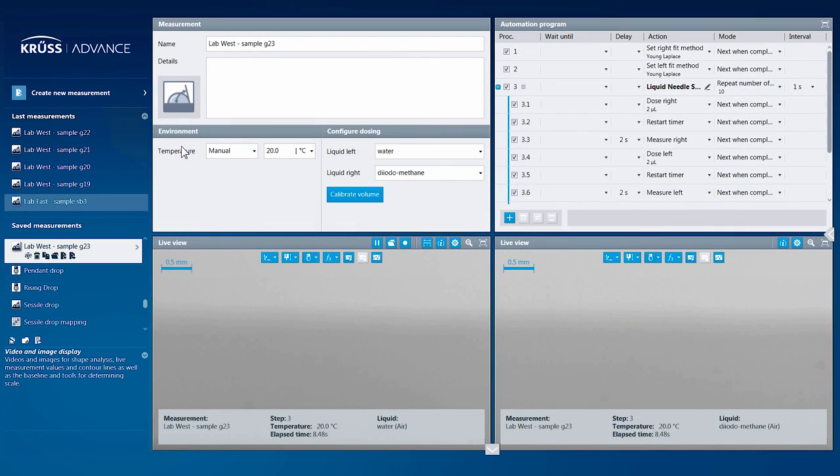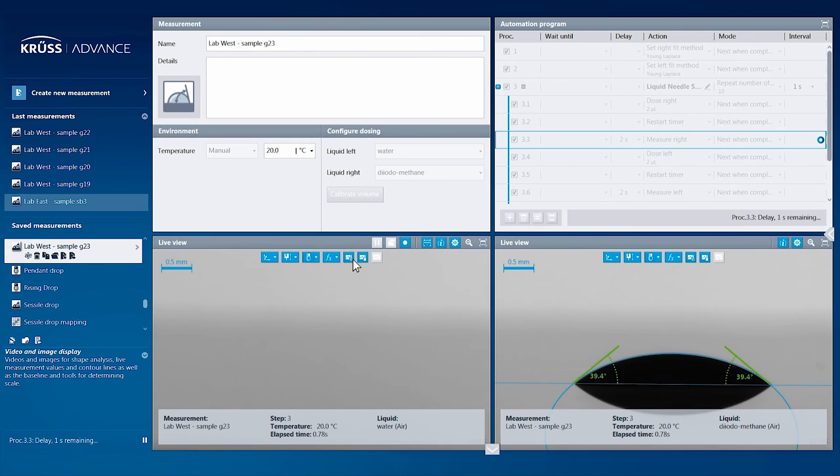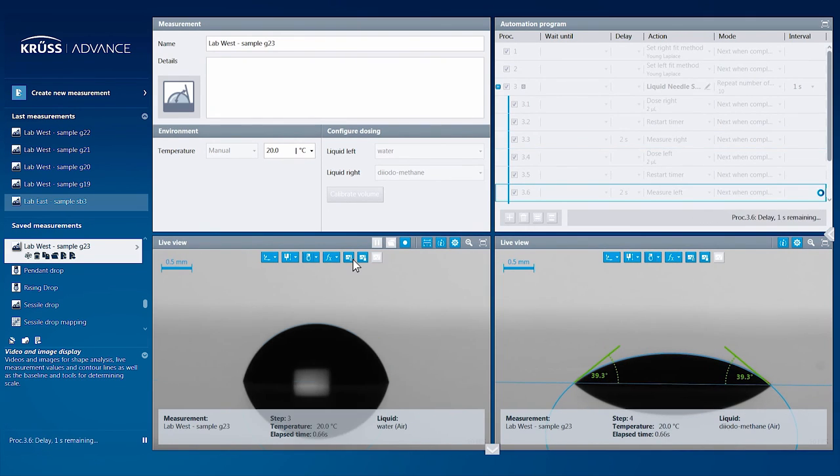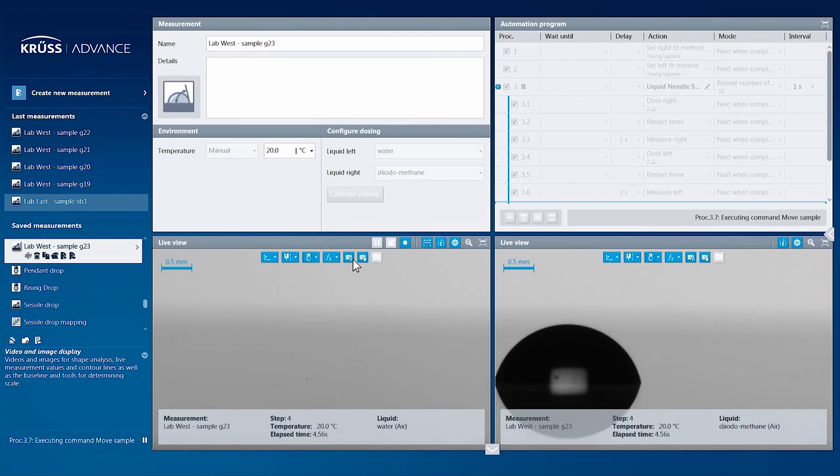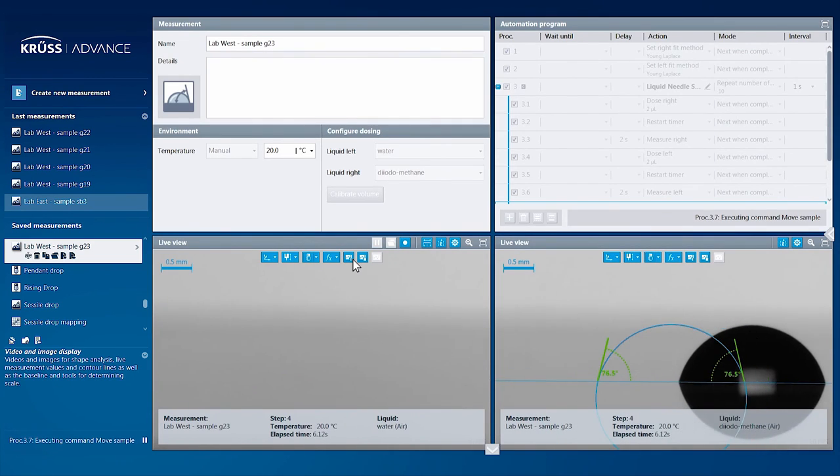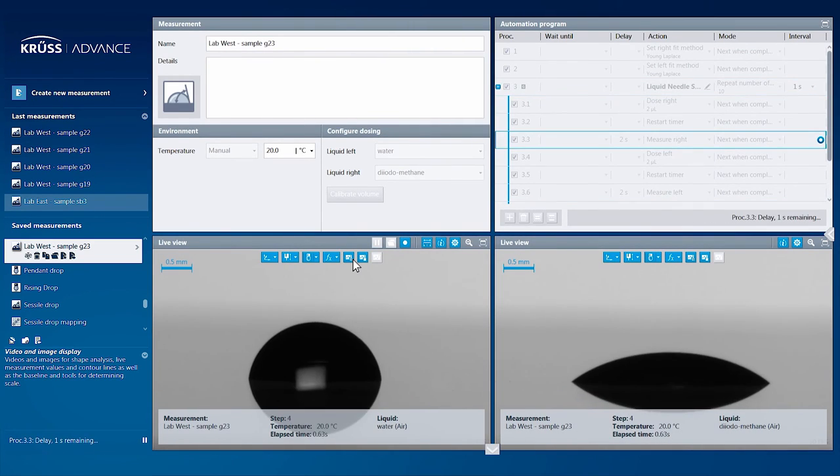Now let's start our measurement. The goal of the automation program feature is to make your surface science measurements as reproducible, quick, and easy as possible.